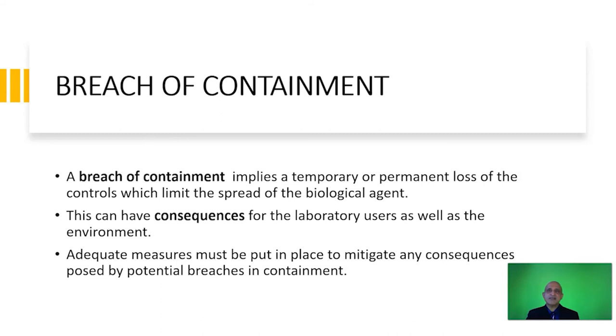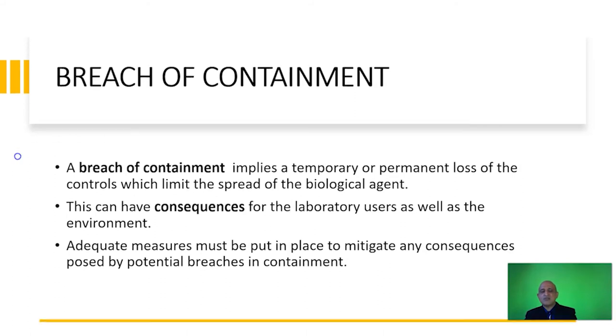So in the case of breach of containment, there are consequences. People can get sick. It can pose a threat to public health and safety. So we need to put in adequate measures to mitigate any consequences posed by potential breaches in containment. This may involve the usage of specific standard operating procedures for emergency release of biological agents from the lab.